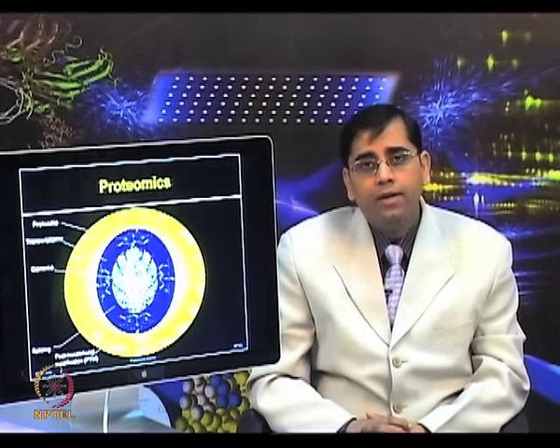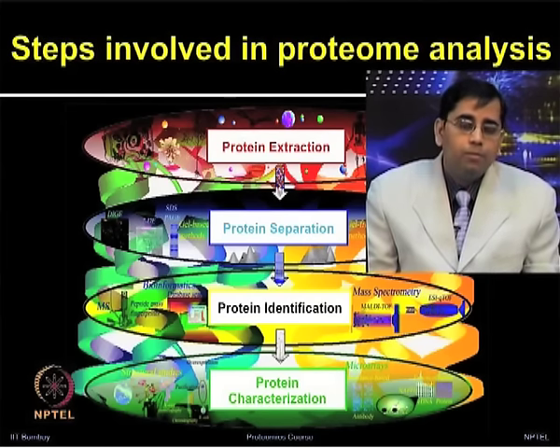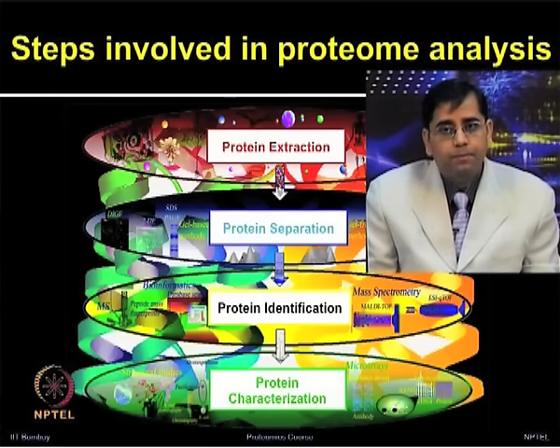What are the different steps involved in proteome analysis? As shown here: protein extraction, protein separation, protein identification and protein characterization. These are the major steps involved in proteome analysis.